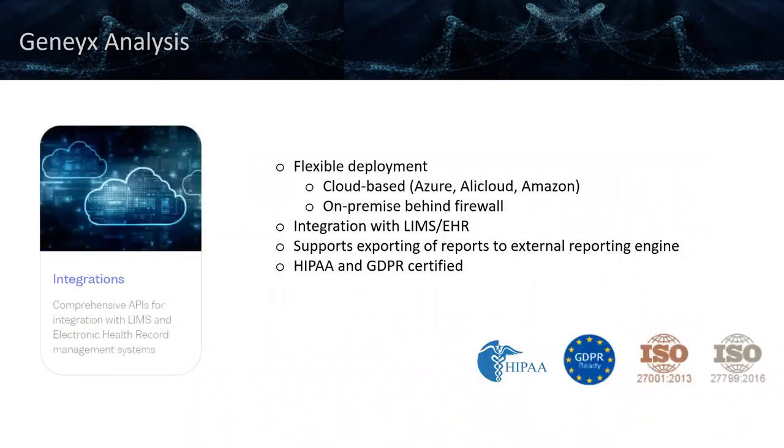In terms of the integration, we have a flexible deployment. In terms of installing the software, this can be installed on cloud. We support Azure, AliCloud, Amazon, as well as some of the other ones that are out there. But it also can be installed on premise behind a firewall. So it is a flexible deployment. We do have clinical labs that have integrated our software with their laboratory management systems or electronic health record systems.